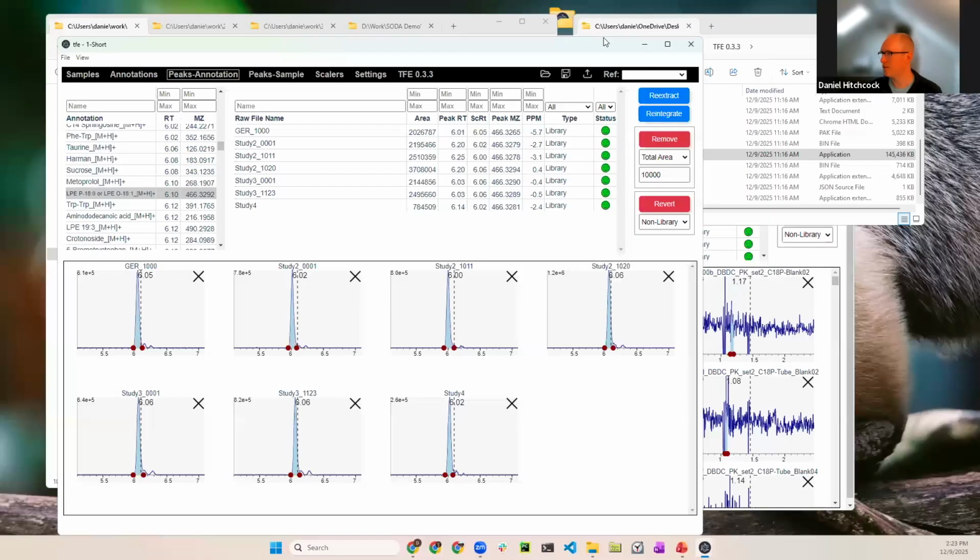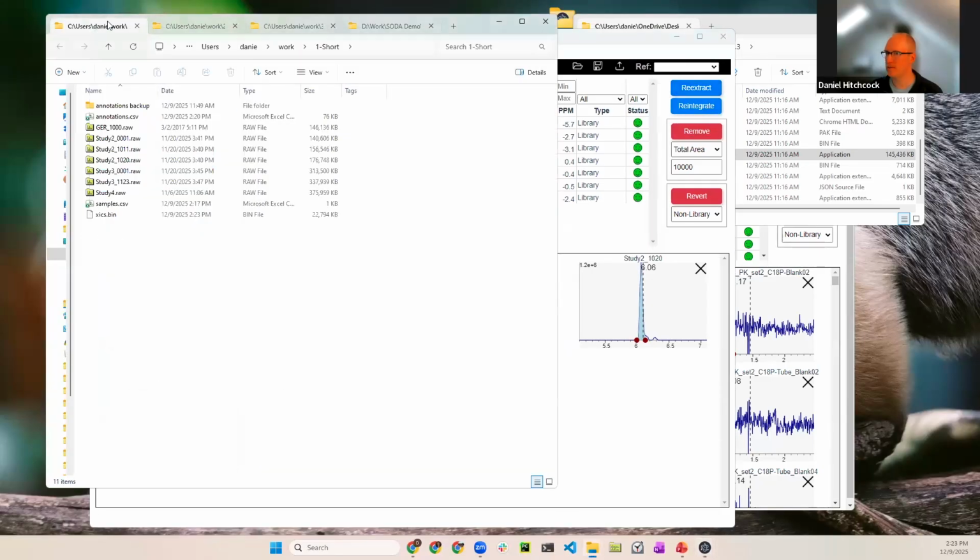Next thing I wanted to show was how easy it is to share the data, at least in a perfect world where everyone inspects everyone's work. Oh, and I forgot. Here's how you get results. You choose which file you want your reference to be, which you don't even have to. I'll just choose one and then click save, and it will save.